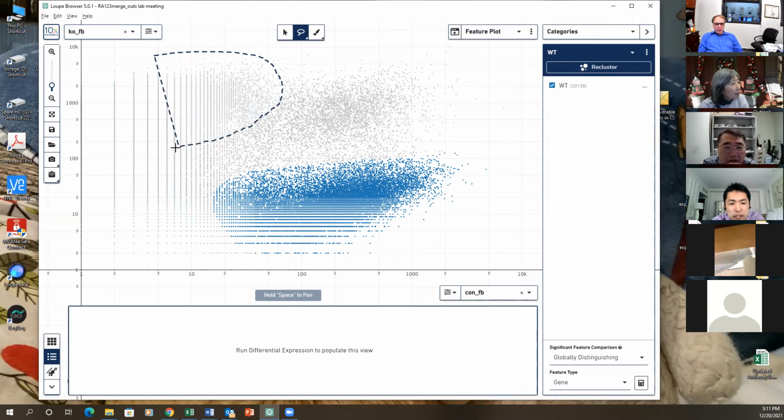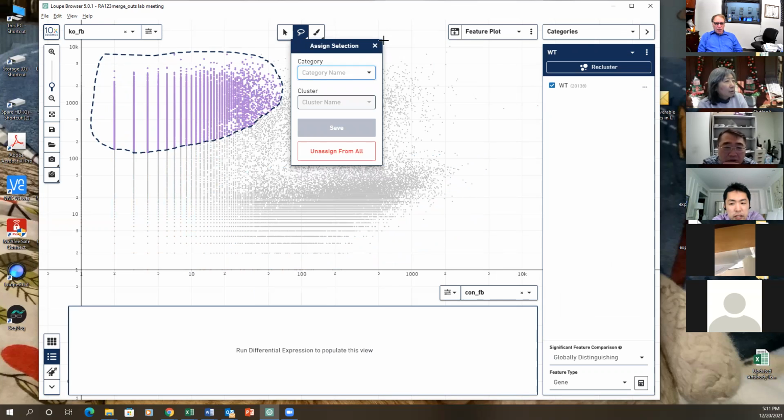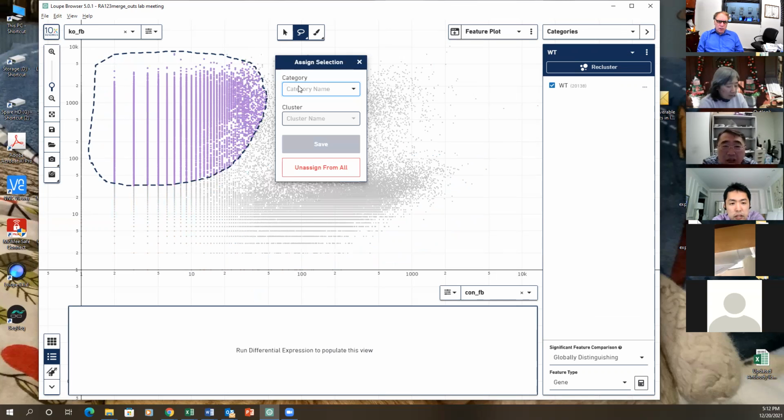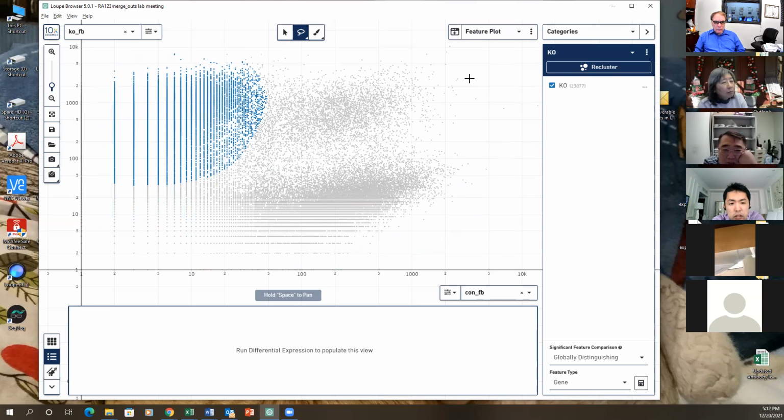Oh, what's going on? Oh, I see. You're going to ignore those ones over there. You should go lower, a little bit lower. Those are positive for sure. You see, you cut off the, yes, go down. Yes, that's it. Now, what are the ones in the middle? Are they just confused? That's doublets. Doublets, I see. Because we actually did a super loading, we got a lot of doublets, about 6 to 10% doublets. I see. All right, what next, Sharon?